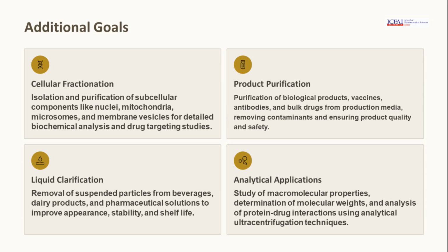Beyond primary objectives, centrifugation also serves additional goals, such as cellular fractionation, product purification, liquid clarification, and analytical applications. These goals demonstrate centrifugation's role in isolating subcellular components, purifying biological products, and analyzing macromolecular properties, making it a versatile tool in various scientific fields.